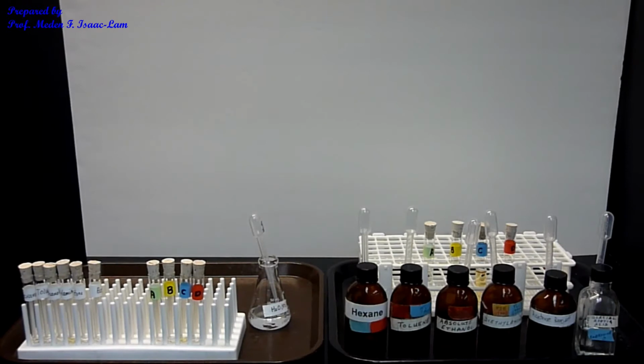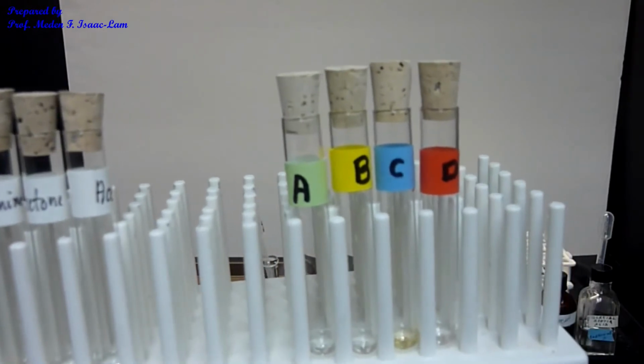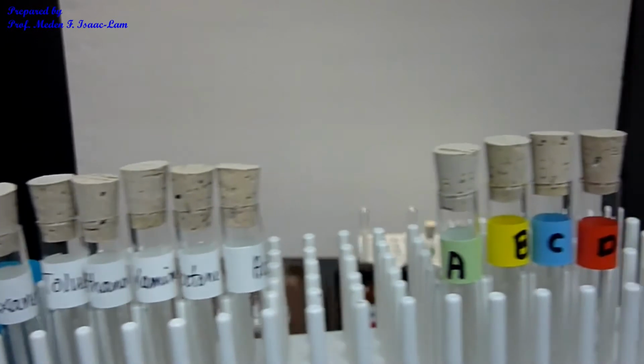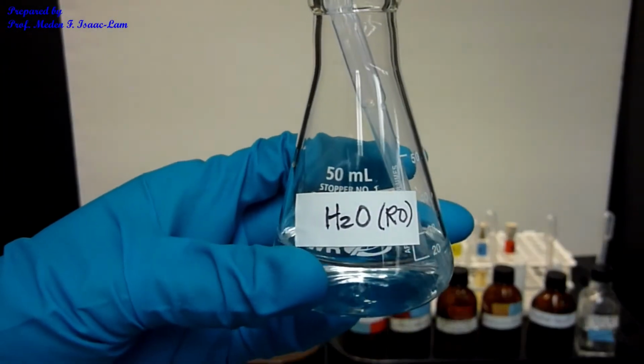I already added 10 drops of each of the samples in each of the tubes, and I already labeled them, including the unknowns. Now I'm going to add water. This is RO water.